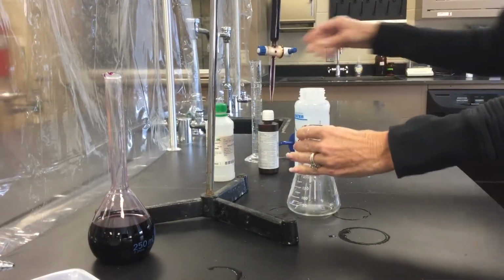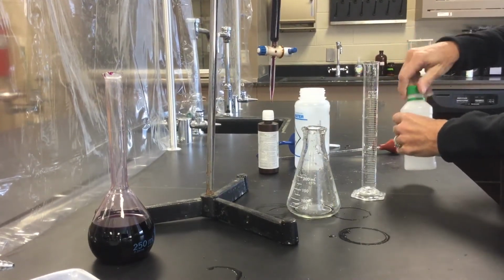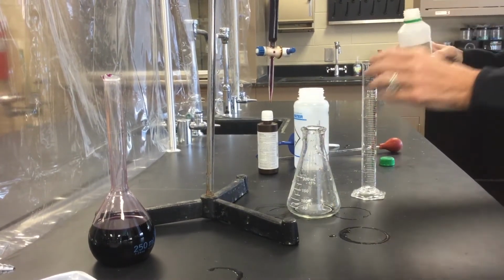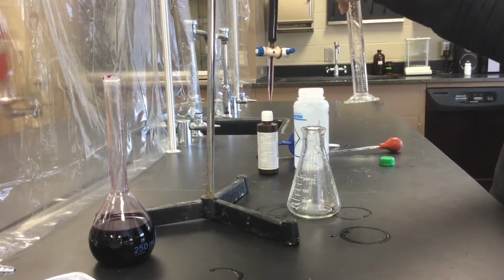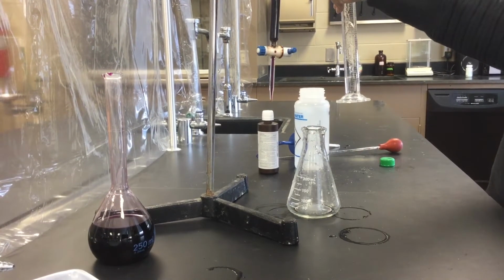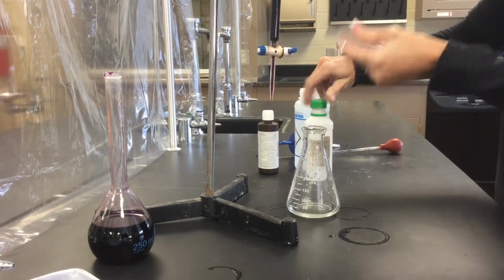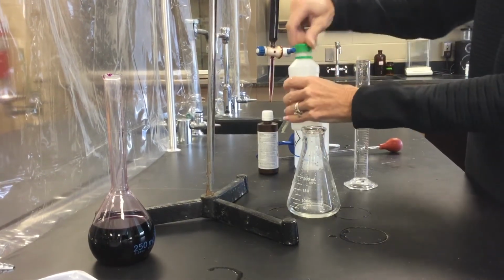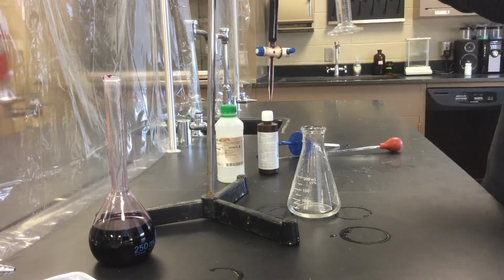Okay, so same thing. Let's see if we can get an even fainter pink this time. So that was, yeah, about 16 milliliters. So there's our sulfuric acid. 10 milliliters of water.